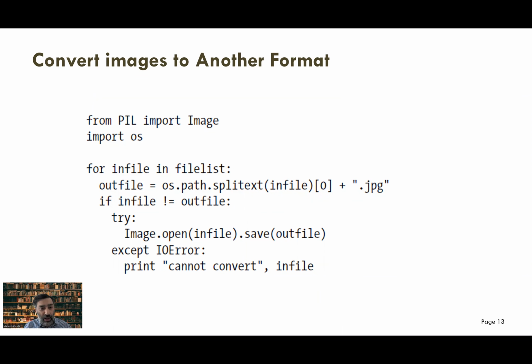So usually what I do, and it always worked well for me, it's not a standard protocol. I'm not saying that this is a general rule of thumb. This was just my practice, and it worked well for me all the time. So what I used to do is convert an image into a smaller size JPEG image and develop all the algorithms on these JPEG images. And once my pipeline is perfect, then I apply it onto the bigger original TIFF images.